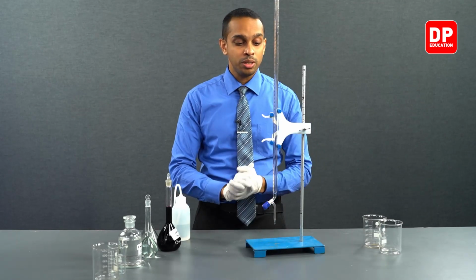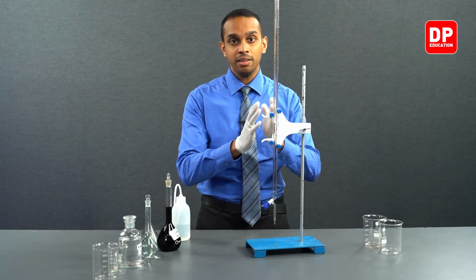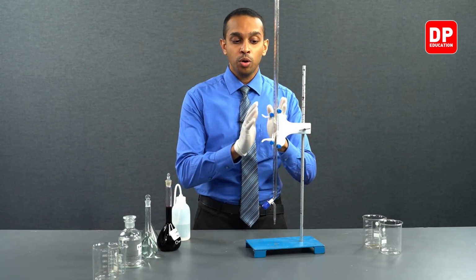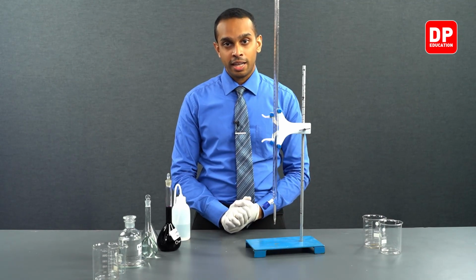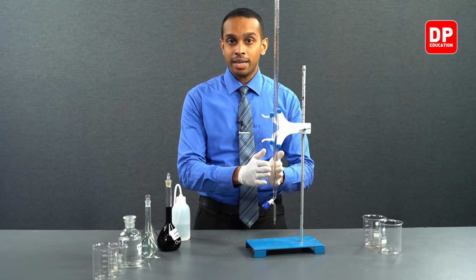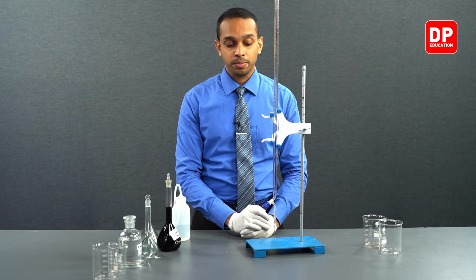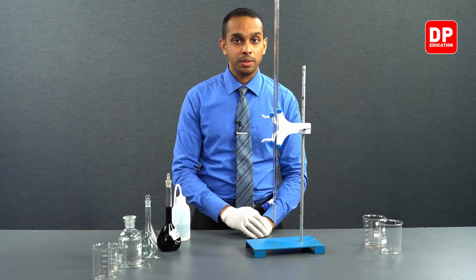So to make sure that it is not going to change its concentration, whatever the solution that we add here, we will have to wash this burette twice, once with distilled water, and a second time with the solution that we are adding to this burette. So let's move on to washing this burette.